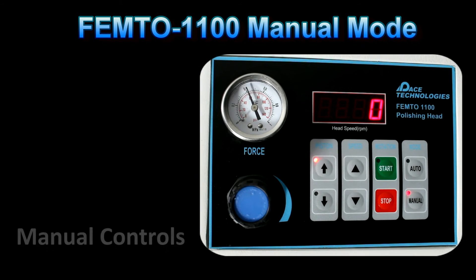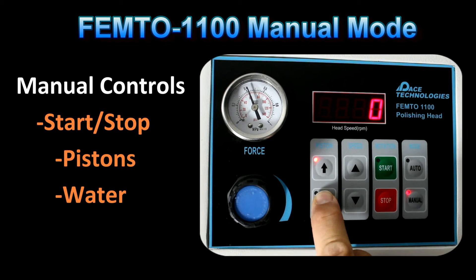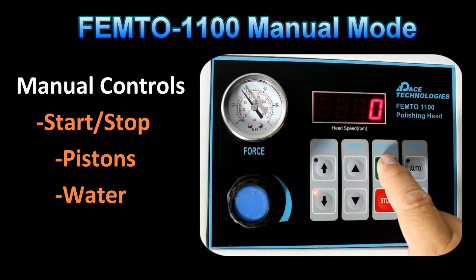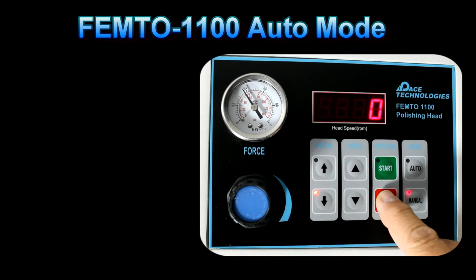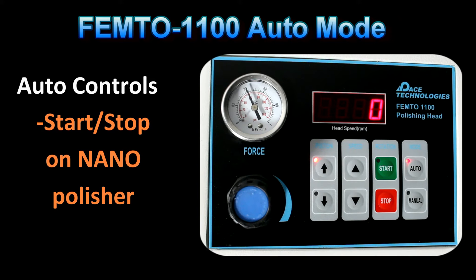The Femto 1100 head can be operated in either the manual or the automated mode. In the manual mode, the pistons will have to be lowered and raised manually. The start button will start the Femto head but does not start the Nano base. In the auto mode, the system will be operated by the controls on the Nano polisher.